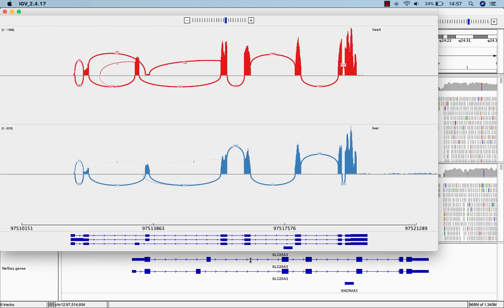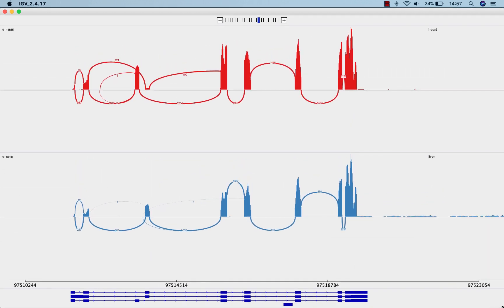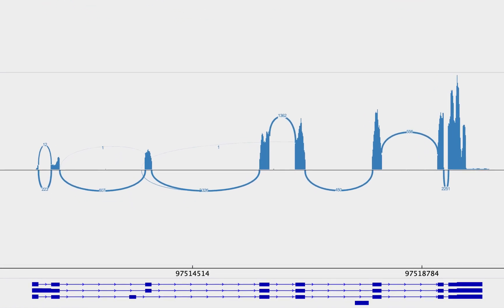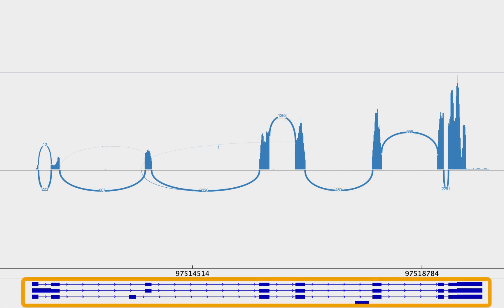In sashimi plots, the coverage for each alignment track is plotted as a bar graph, and arcs representing splice junctions connect exons. The numbers you see on each arc are the junction depth, or how many reads span a given junction. And at the bottom, the gene isoforms are shown.